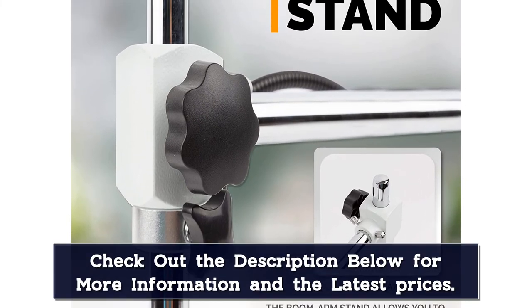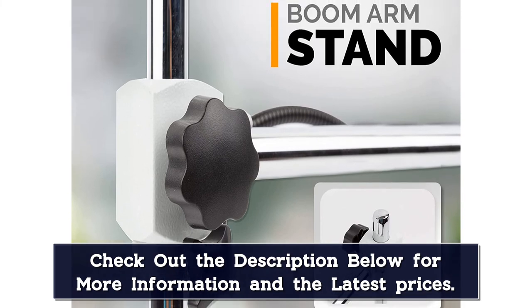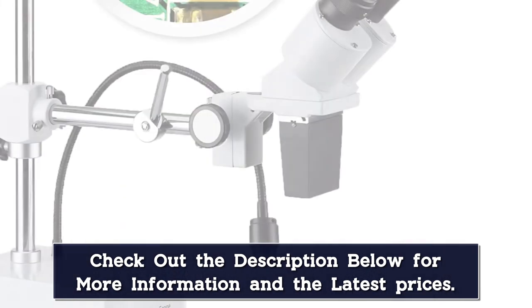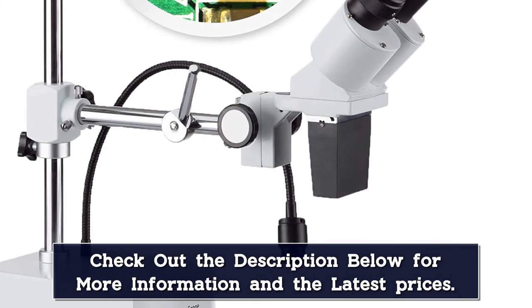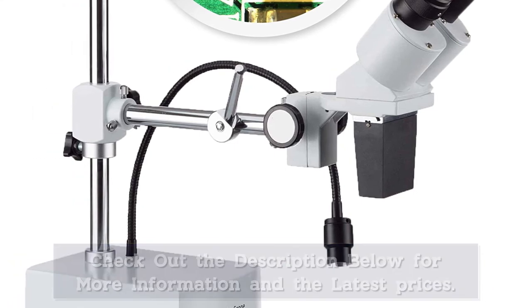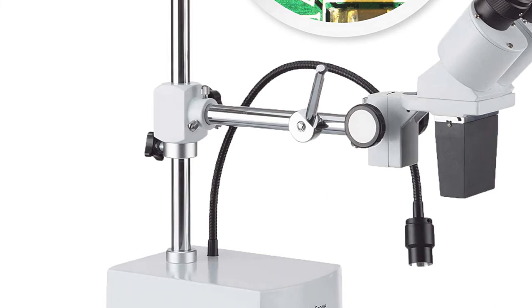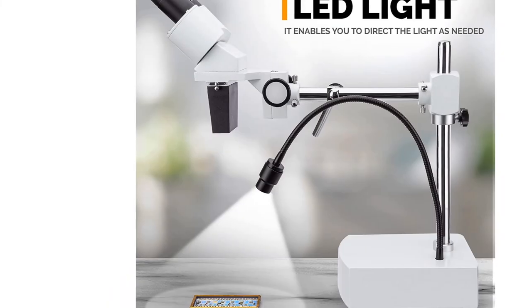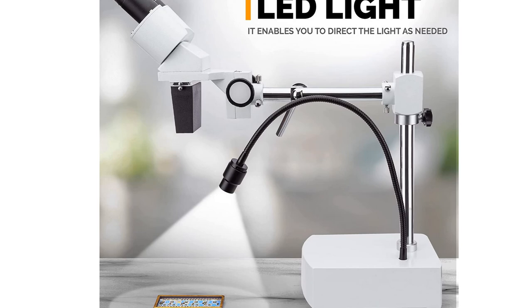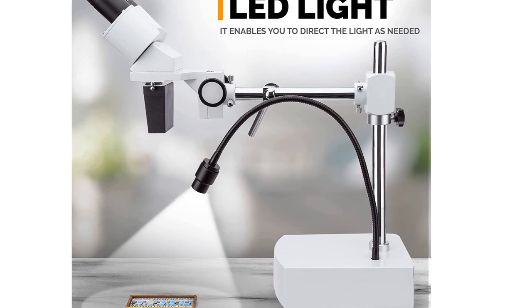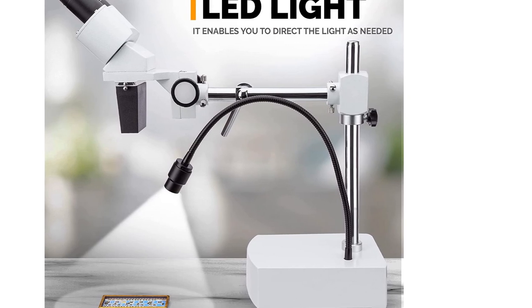Boom arms are excellent for stereo microscopes because they allow you to look closely at a broader range of objects. With a vertical distance of 9 inches and a horizontal distance of 12 inches, you can get up close and personal with tons of items, from the tiny to the massive. That said, you do need a stable desk for the base, so keep it in mind.